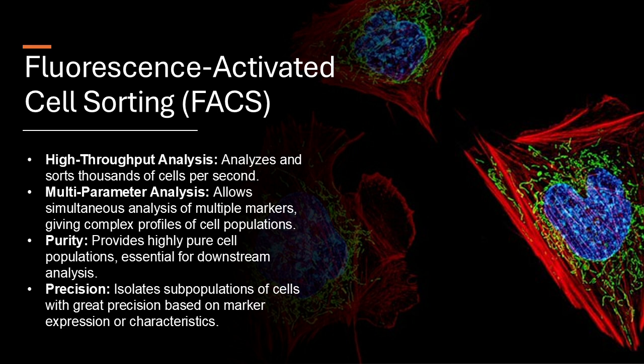I'm also curious about the analysis of the data. We're talking about thousands of cells per second. It must be a huge amount of information to process. Yeah, you're absolutely right. Analyzing that FACS data can be quite challenging. But new computational tools and software are being developed to help researchers visualize and interpret this data.